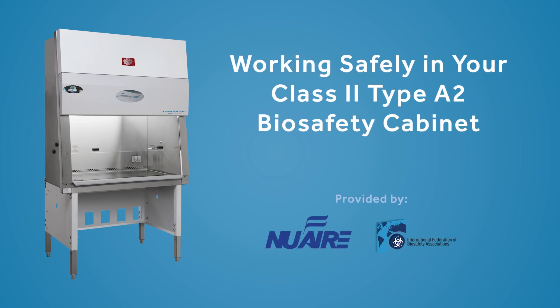In this video we will demonstrate some recommendations that industry guidelines and experts give us for using a Class 2 Type A2 biosafety cabinet.